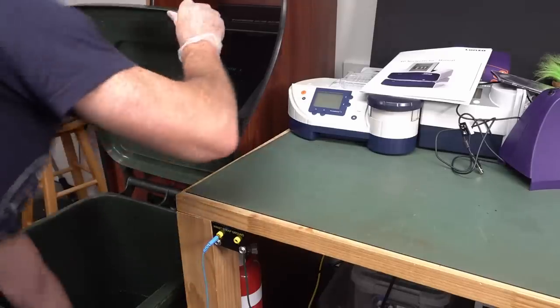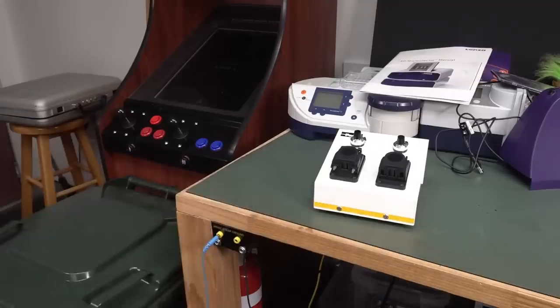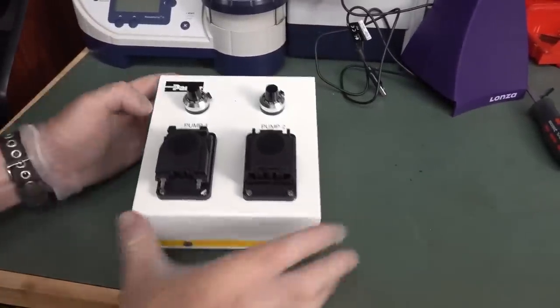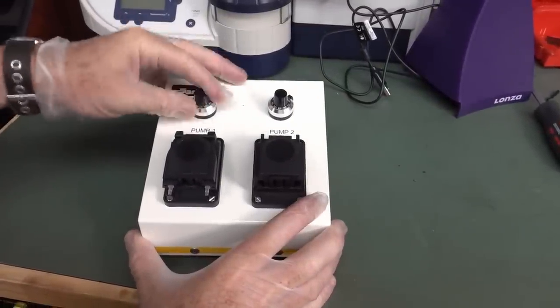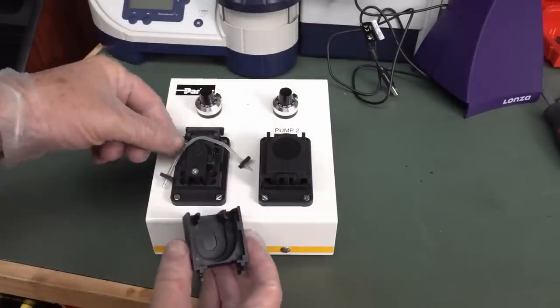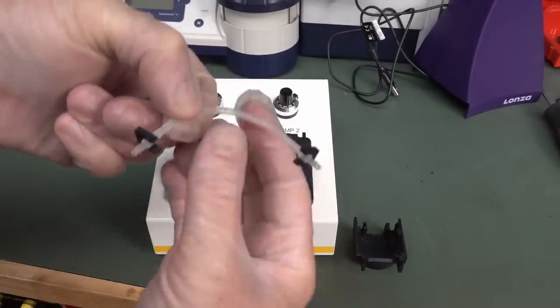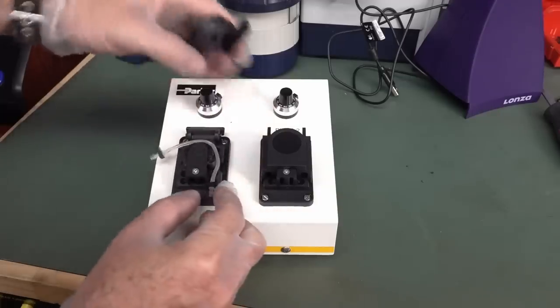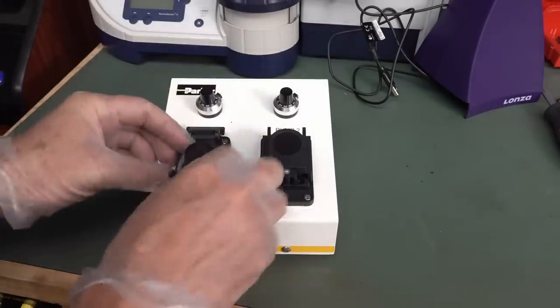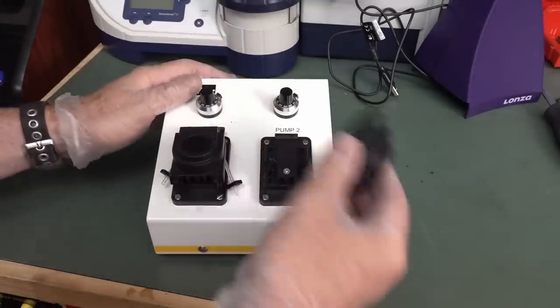I have one more item, which is rather interesting. Look at that, Parker. So it's not branded that. Look at that, 10-turn pots. Thank you very much. And whoa, look at the way... Is that being used? Is there any liquid in that? I wonder. Yeah, so you wrap your tube around there like that, and it's just got a wheel in there that changes your pump rate of whatever stuff you've got flowing through the tube.